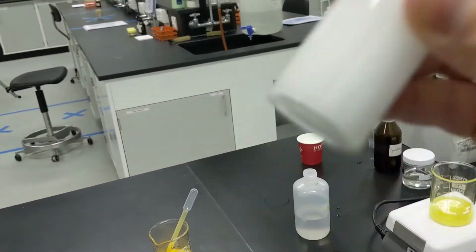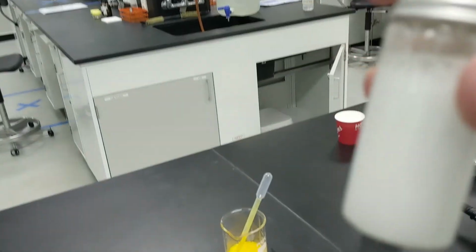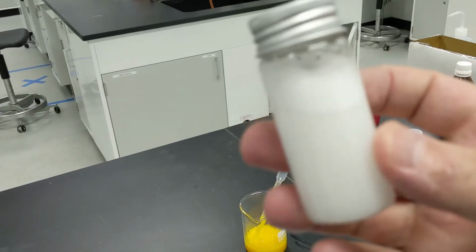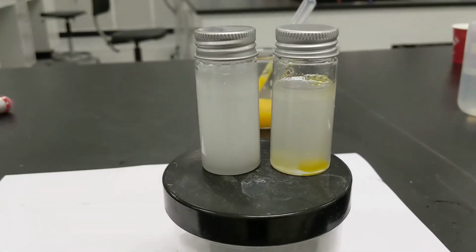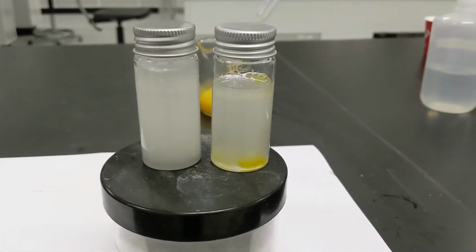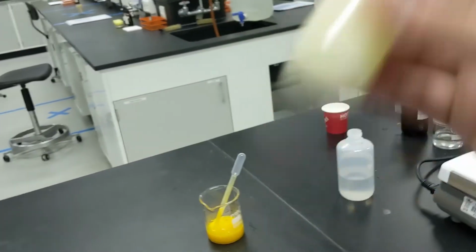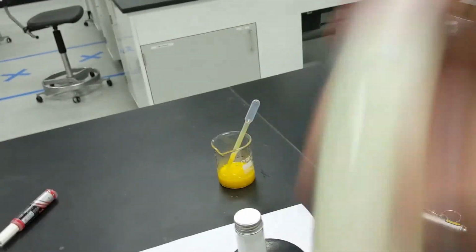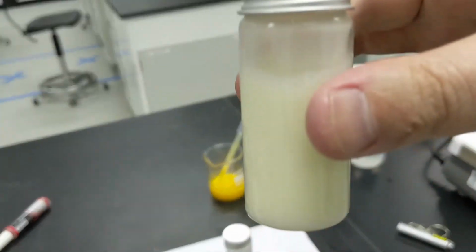I'll give them a good shake, and then we'll let them sit and watch again and see if some sort of emulsion will be formed. Now, one disclaimer about this one is soap, which means it will kind of create some bubbles. That's unavoidable for soap. So let's see what happens with the egg yolk. This again might change the color because the egg yolk is yellow. But I don't care about some soap bubbles on top or the color being changed.